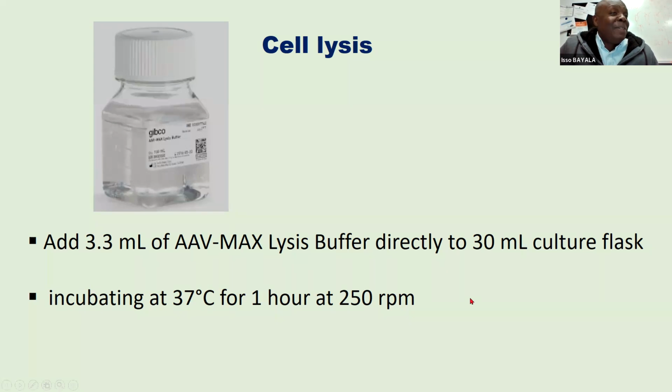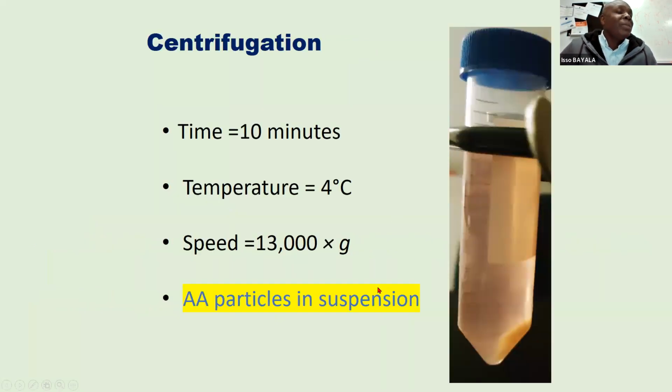In the supernatant, the virus particles are in the supernatant. That's where we stopped for the first part of this project.